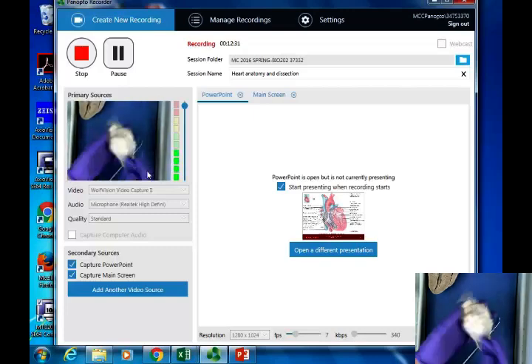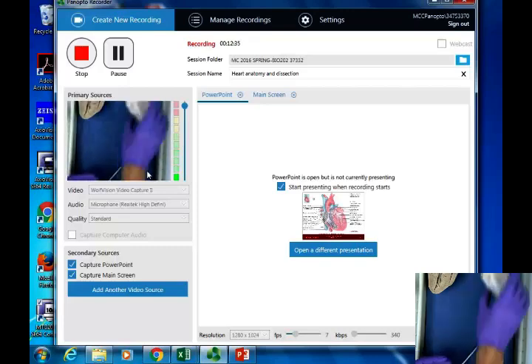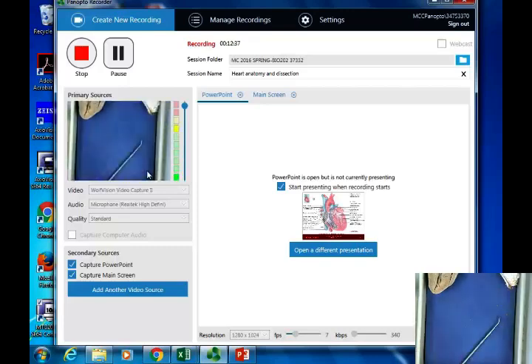But that's our pericardial sac. So if you were to see that on lab practical, it would look like that. Okay. What other goodies do we have here?